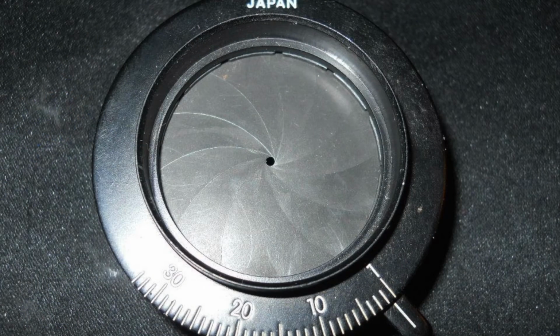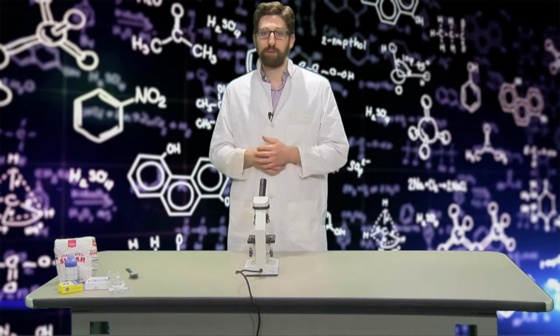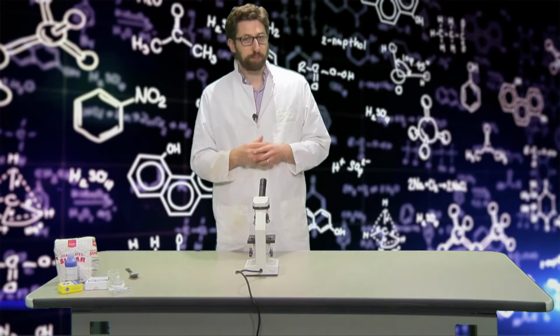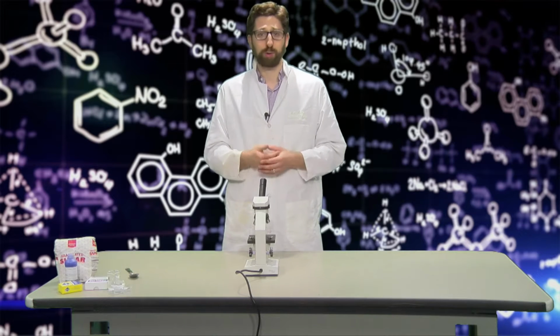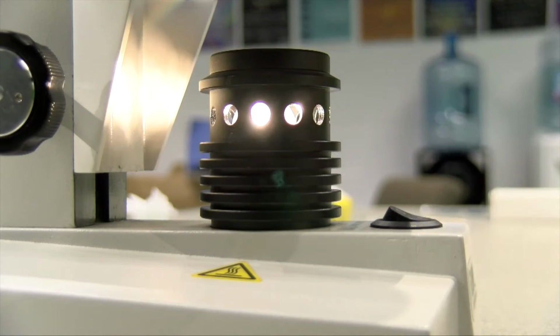Two more. This is the diaphragm. As I turn the diaphragm, I can let more light in or less light in, depending on how much light I need to see my object. And finally, of course, it's a compound light microscope. I need some light. Some microscopes actually work with a mirror to reflect light, but ours just has an on switch that lets light come in.